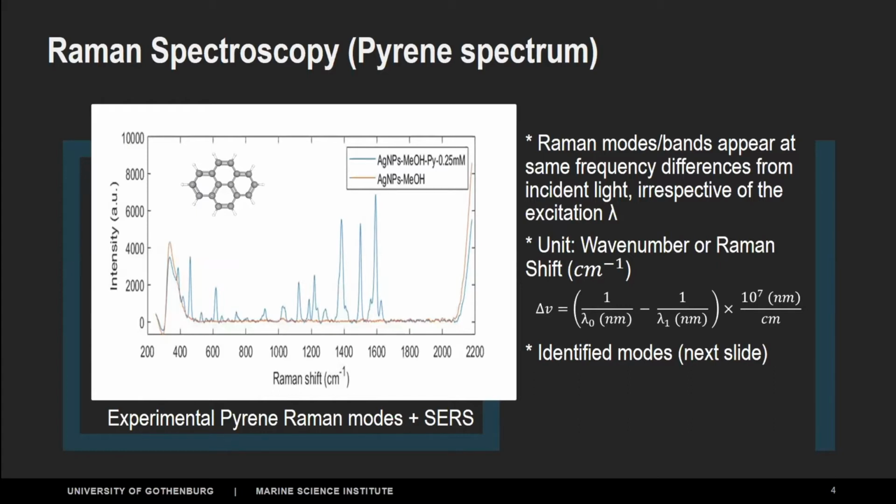And all those peaks you see there, they are from pyrene, which I'm using in this study. It's a molecule that has 4 benzene rings, and it starts dancing when it gets the laser light, and it gives me those peaks of specific wave numbers. And I know exactly those are the pyrene signature. And they're always there. Doesn't matter what kind of laser wavelength you use, I'm always gonna get these numbers.